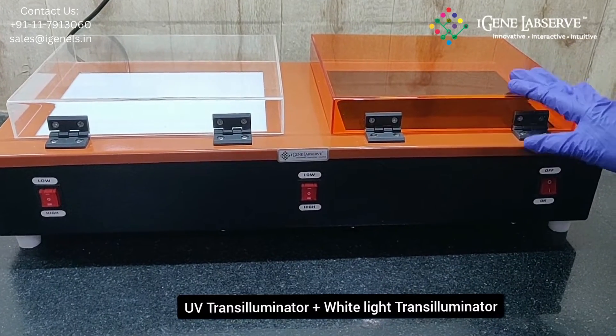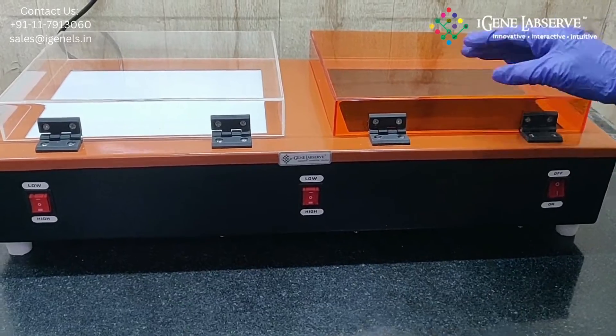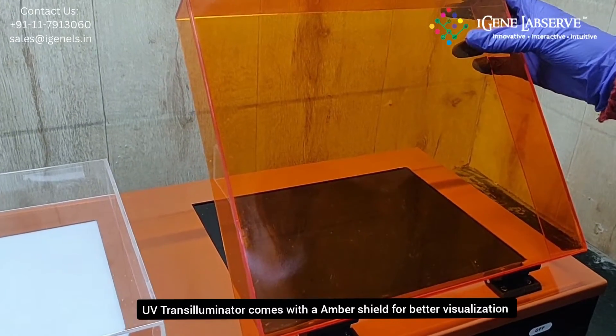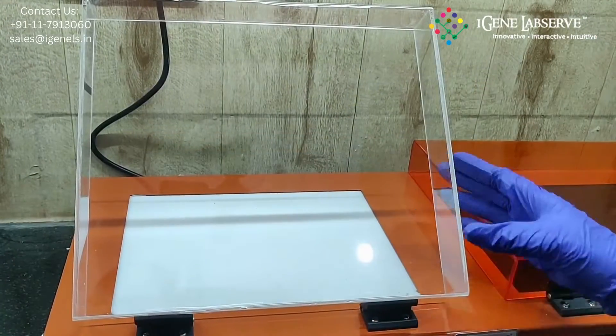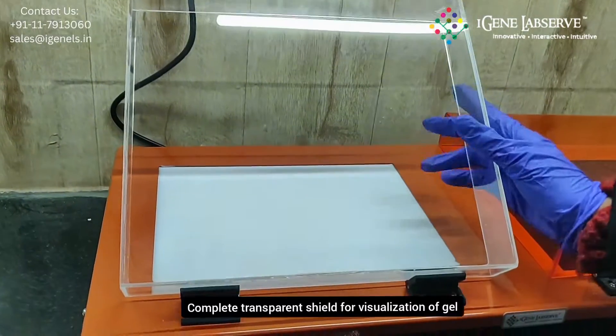This is iGene's UV transilluminator plus white light transilluminator. The UV transilluminator comes with an amber shield which is transparent for better visualization of the gel. The white light transilluminator has a completely transparent shield for visualization of the gel.